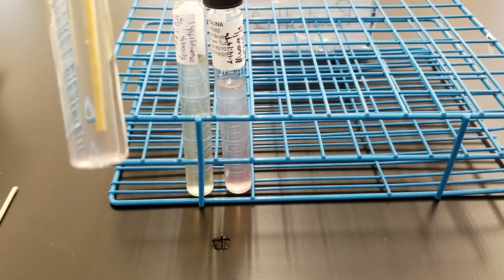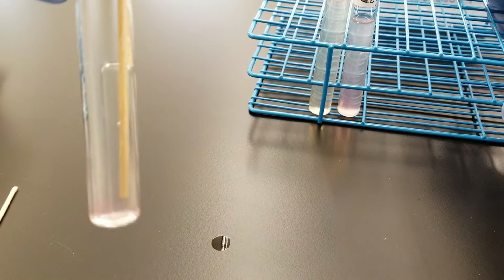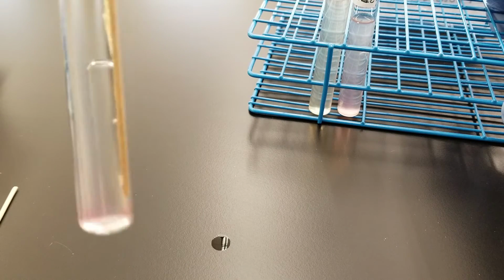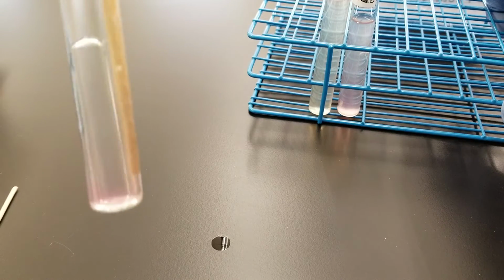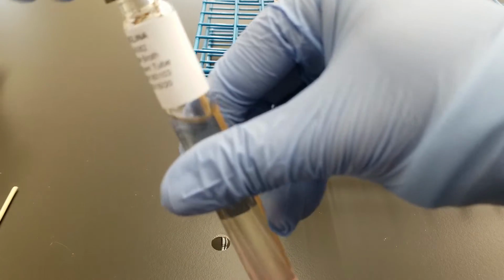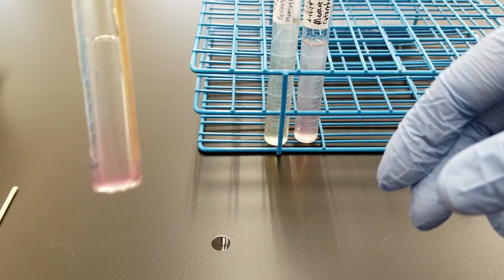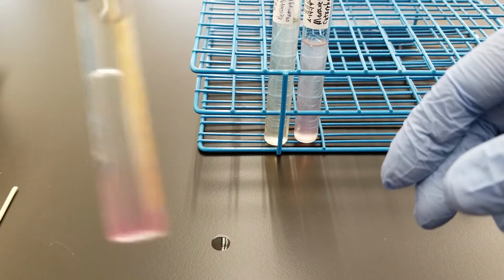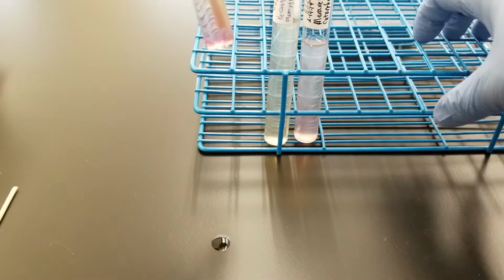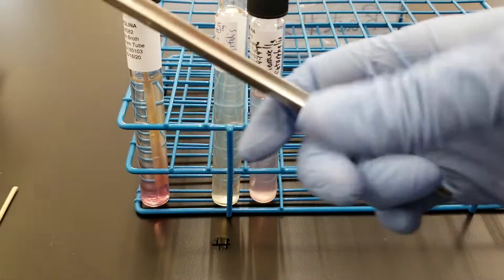It's changing a little bit. I'm not sure you can see that on the video. There's, see the little bit of pink? So that's showing that it was a true negative, right? Because if there's a pink color after addition of the zinc dust, then that means it was a true negative, okay? There is no reduction of nitrate past nitrite. So really, that's all you need is that little bit that was on the stick. I'll show you the spatula version.